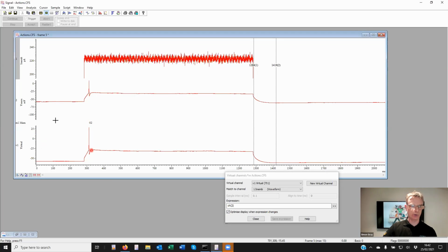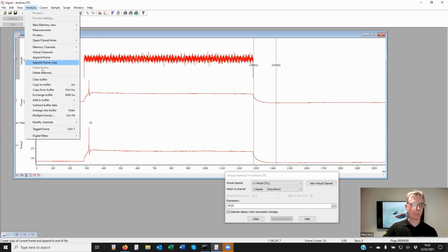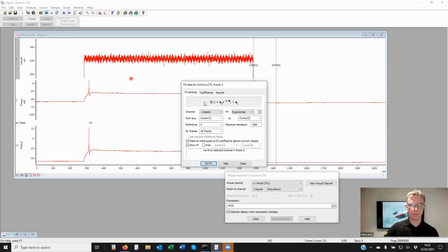At the moment, the virtual channel just has a copy of channel 2 in it. Now you can imagine if I wanted to remove this decaying exponential, I could fit something to it and do a fit.